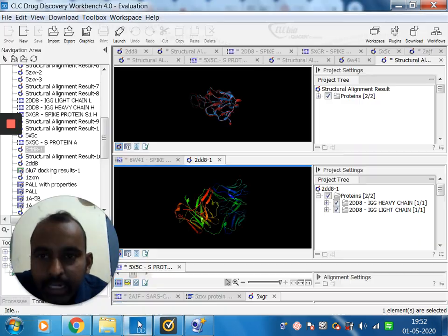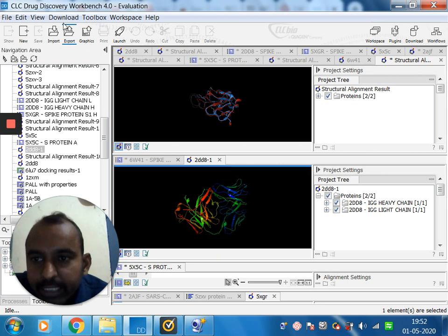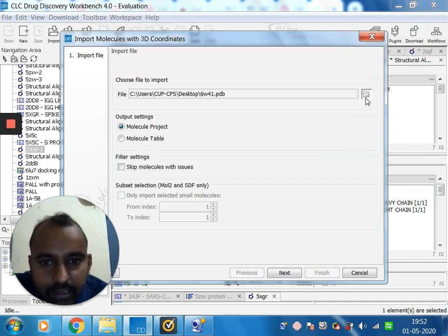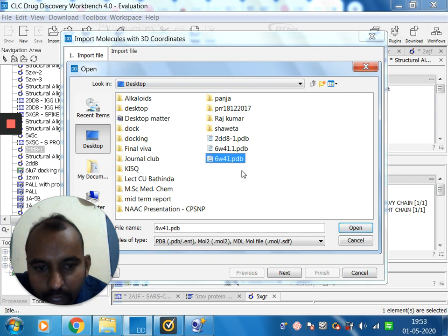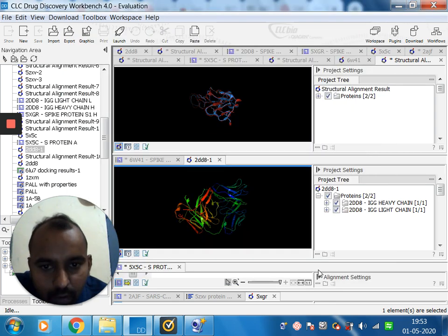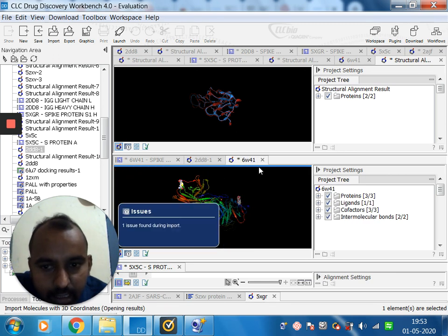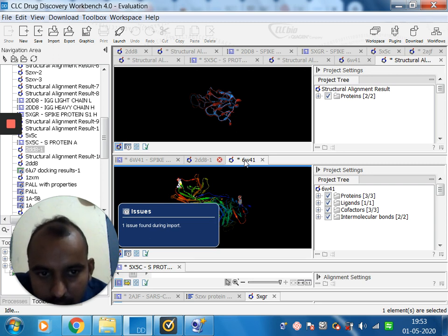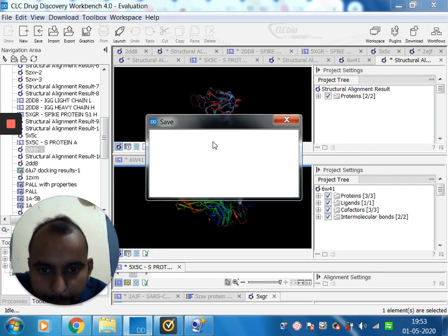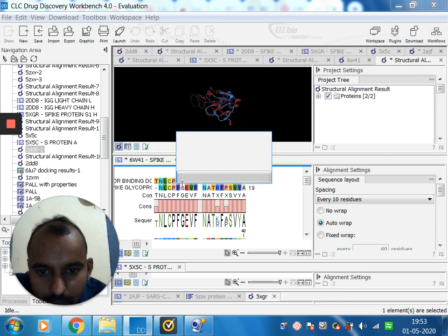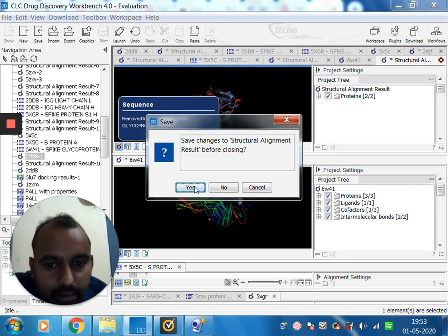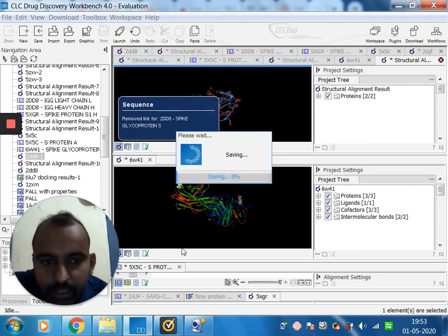Now let's see how protein alignment and docking are useful. I am importing the 3D molecules — specifically the 6W41 PDB file. Once I click it I will get the crystal structure. I am closing all the other windows.